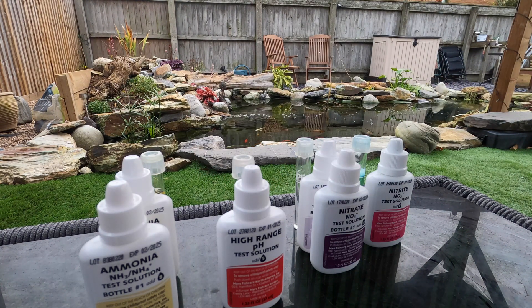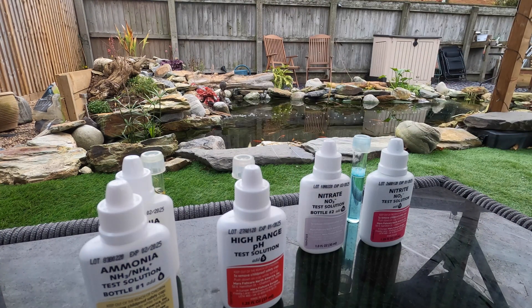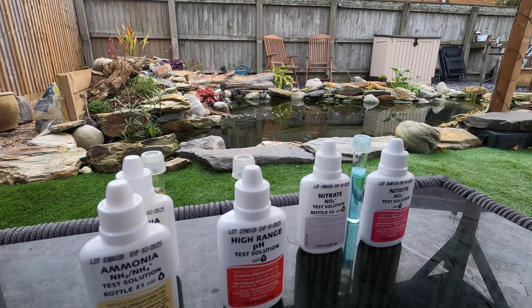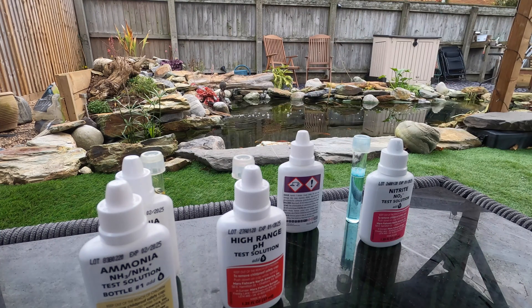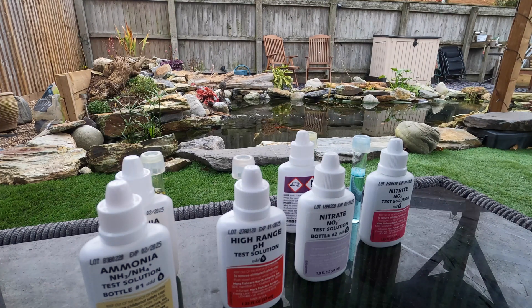Now we'll do the nitrate - this one takes a little longer. You've got to really shake the solutions. We'll put 10 drops in first, then vigorously shake for 30 seconds - I'll edit that out. Then 10 drops of solution two, and now we've got to vigorously shake this for a minute - again I'll edit that out. Stick that back there. Now we'll give it another minute or so and then check the progress on the colors that need five minutes to develop.